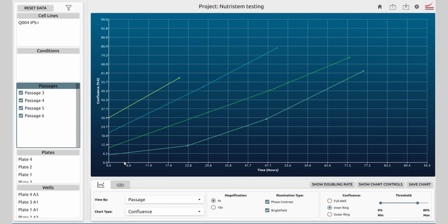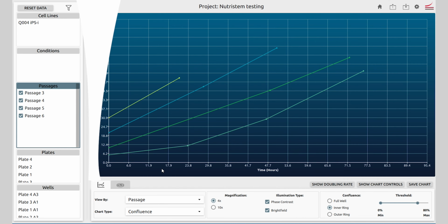In this real-world example, the analytics workstation revealed some interesting characteristics that the researchers had previously not seen. Based on these new findings, they decided to revisit the earlier work using the capabilities of CellAssist.